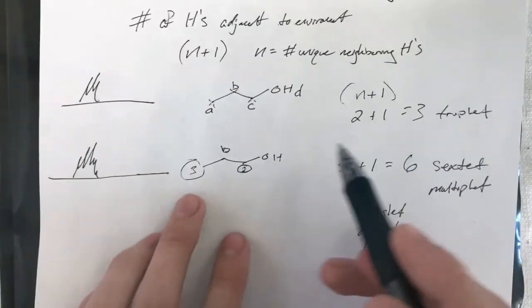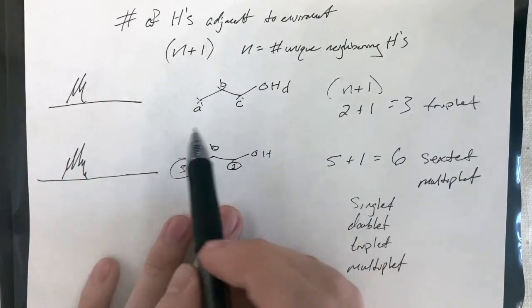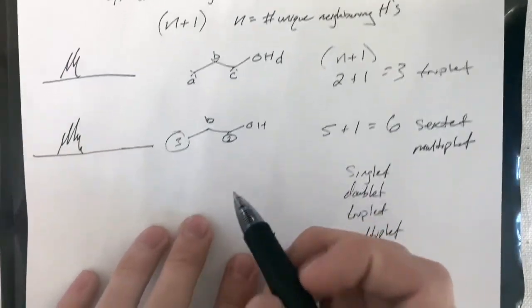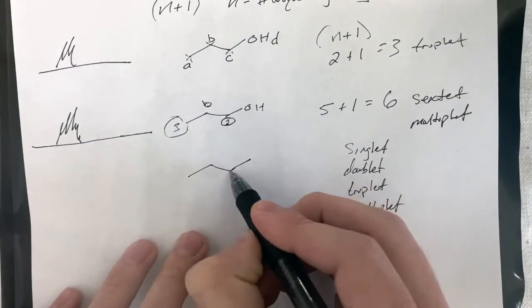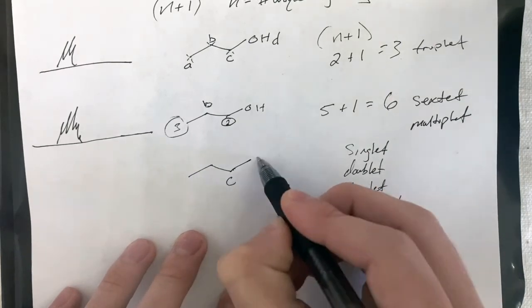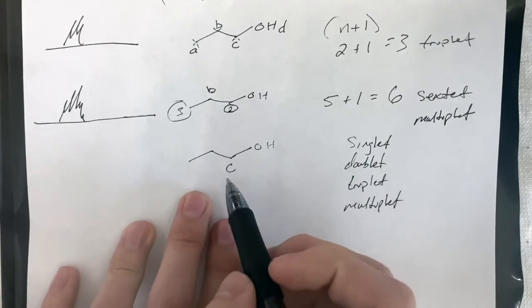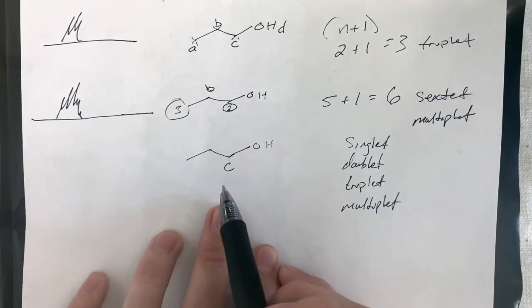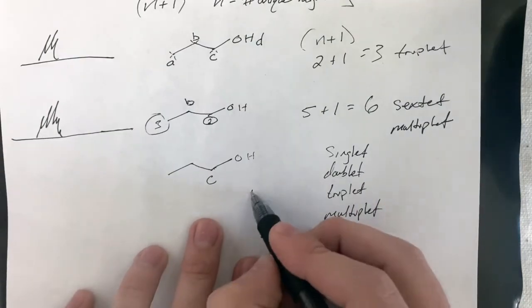And given that, you should be able to figure out what the structure may be. So again, continuing along this molecule here, looking at C, what are the neighboring unique hydrogens? Again, we're doing n plus 1.